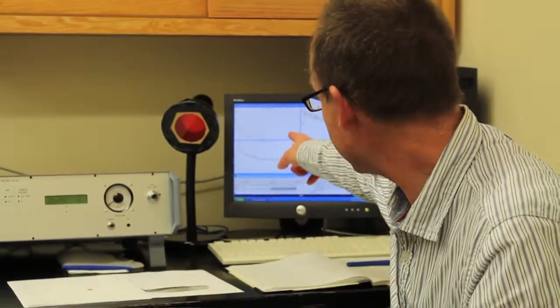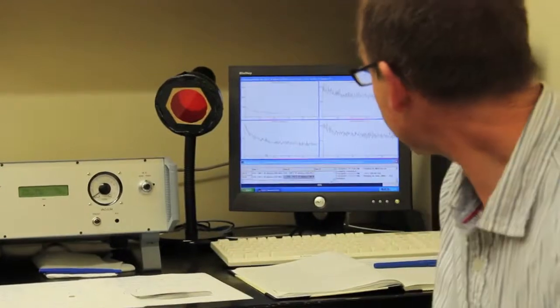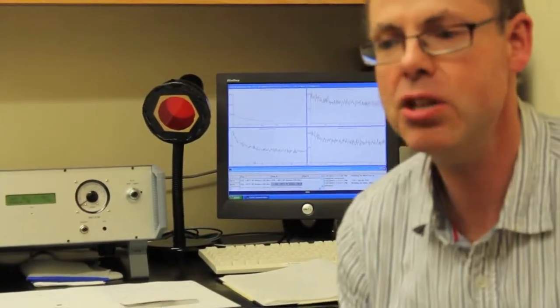Oh, we have a signal here just developing on the screen. And the magnitude of that signal depends on the length of time that the grain has been trapping electrons. So we're developing this to form what we call a thermochronometer. And the exciting thing about this is the temperatures we're talking about are very low, which means that we can look at processes happening very close to the Earth's surface.